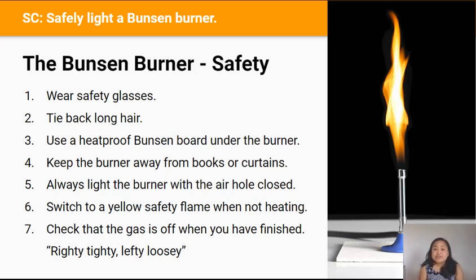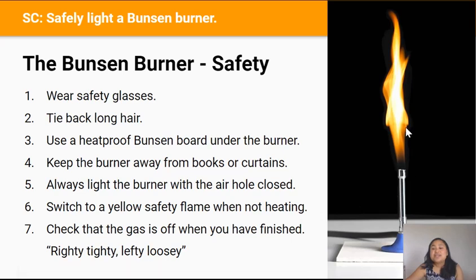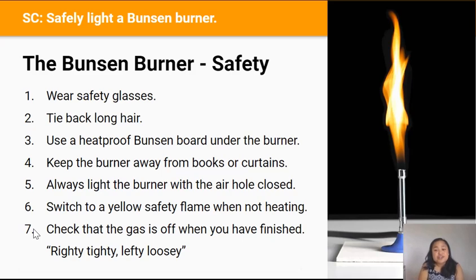Rule three: use a heat-proof Bunsen board under the burner to protect the bench from heat. Rule four: keep the Bunsen burner away from books, curtains, or anything that can catch on fire. Rule five: always light the Bunsen burner with the air hole closed, and switch to a yellow safety flame when you're not heating anything, so that people around you can see the flame. Rule seven: check the gas tap is off when you've finished using the Bunsen burner.